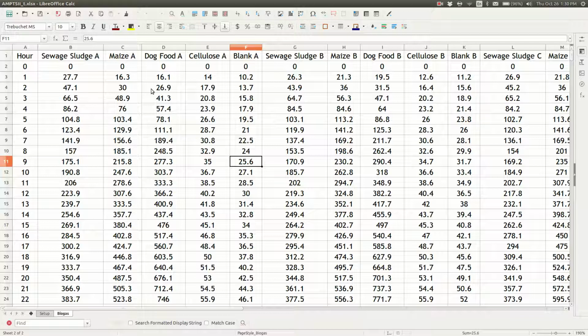In this video, I'll show how to use OBA to check the relative rate of biogas production, which can be used to determine when to end a BMP trial. So I'm going to start out with some data from the AMPTS2 system from Bioprocess Control.